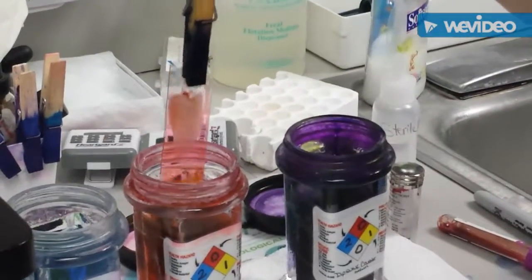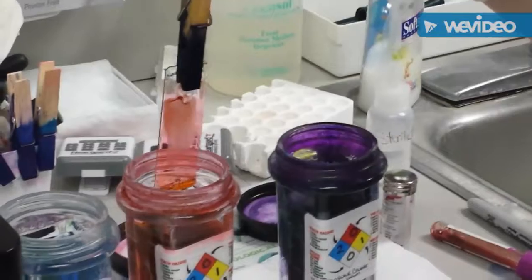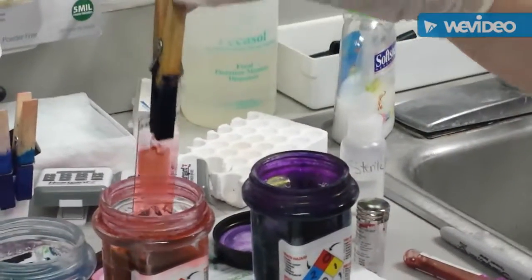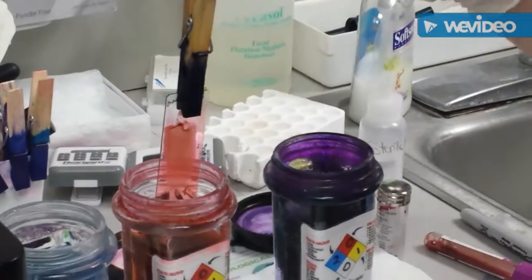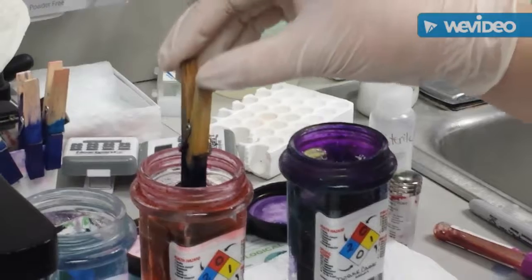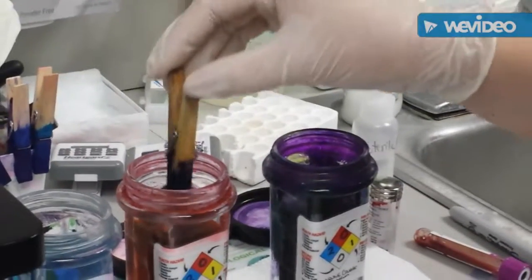On to step 2 of our stain. You also want to make sure that there's no places that the slide lifted, so that there's bald spots or streaks in it.